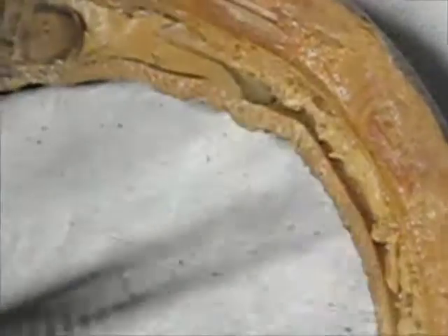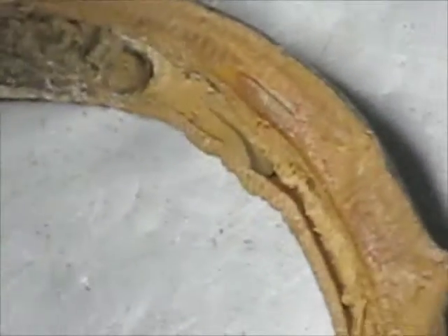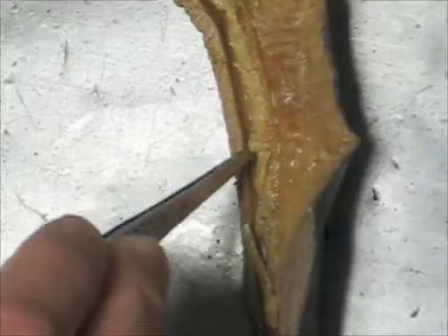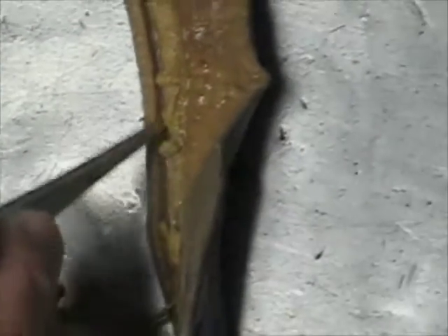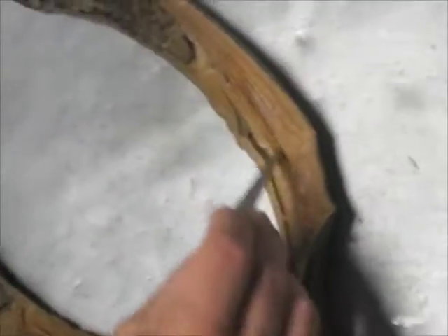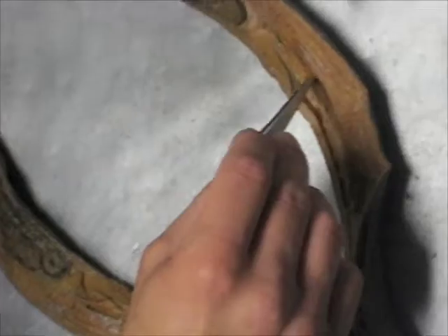What was in this groove was the intestines. Oh, here it is, on the other side. Everybody see this little groove right down through here? Here's where the intestine is going to be running. This groove right here is where the dorsal aorta is located.